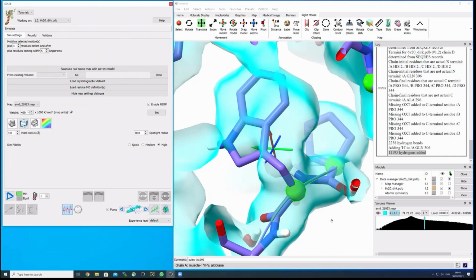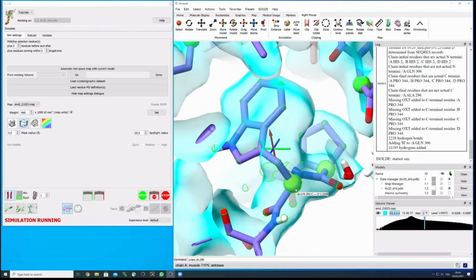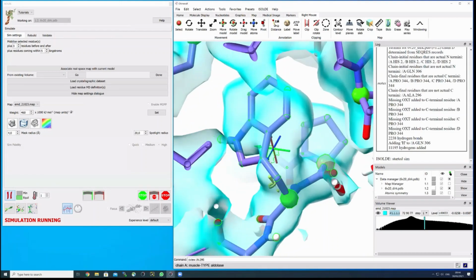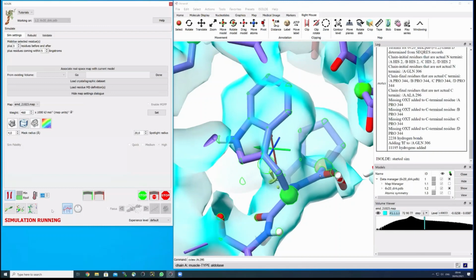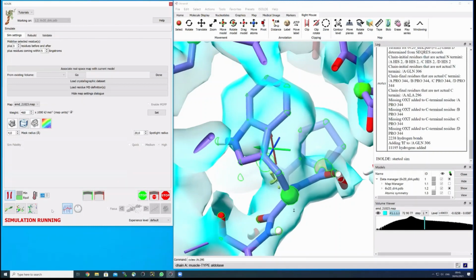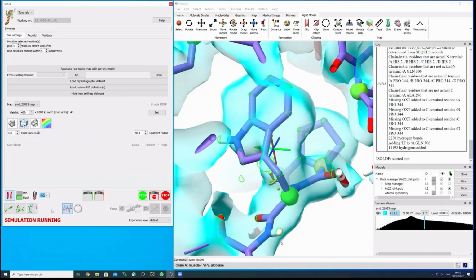Again, I'm having 3 residues mobilized, 5 Angstrom environment, and 1 Kelvin, so things won't be moving much. And now I click on play, and the simulation will start. And you will see that things start moving. And they don't move a lot because I'm at 1 Kelvin. But if I change this to 100 Kelvin, you will see that things are basically wobbling like mad. So like this, you can basically change the temperature you want to work with.